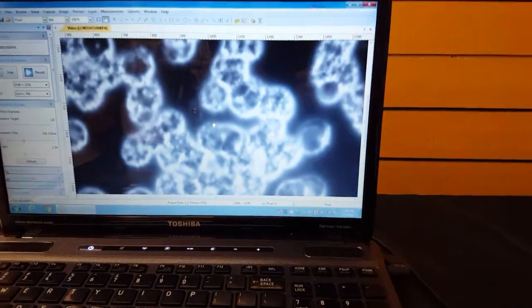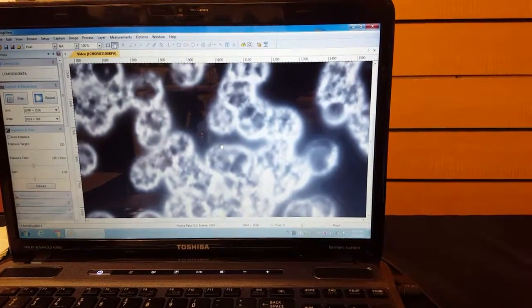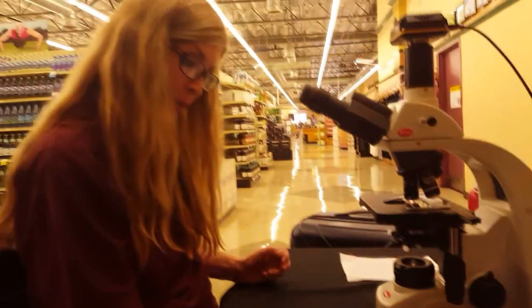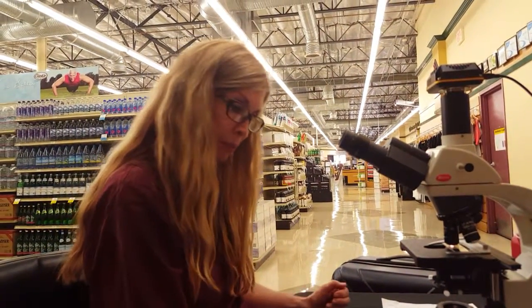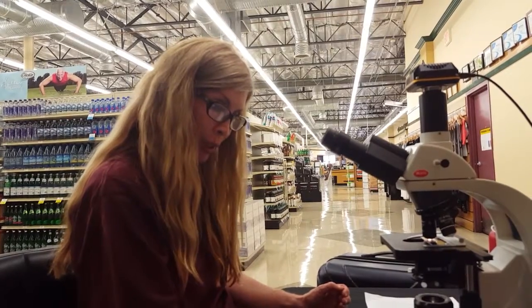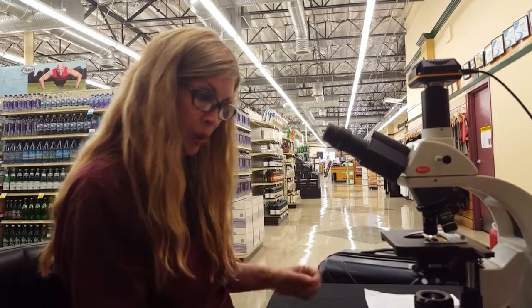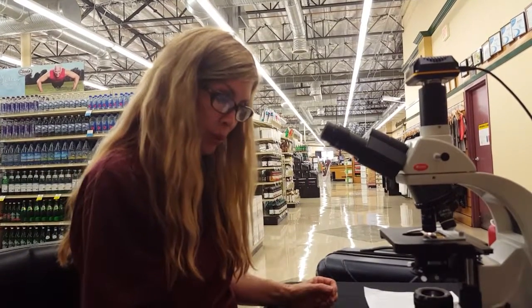That to me looks like a white cell right there, and it could be healthier. So this to me is probably a white cell. Looks fine. All right. Let's see here. I don't see any blood clotting. I don't see any targeted centers. Sometimes centers have a target in there, which means you have gallbladder issues. I don't see that.